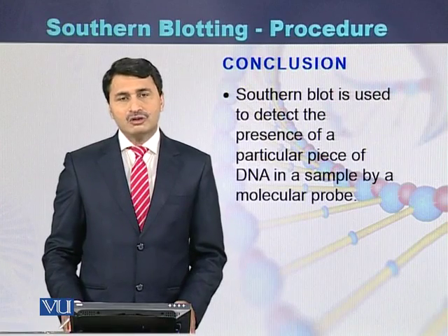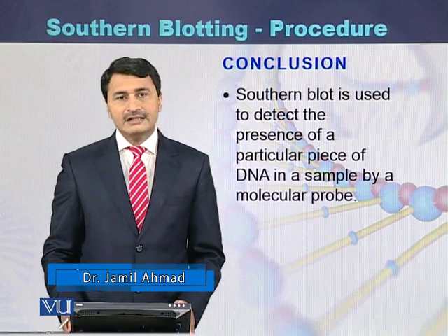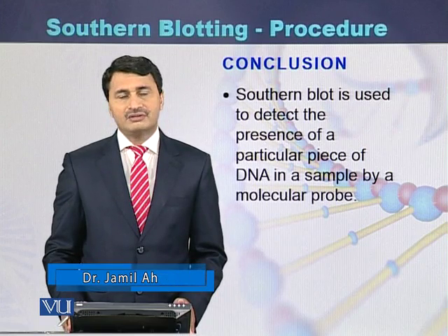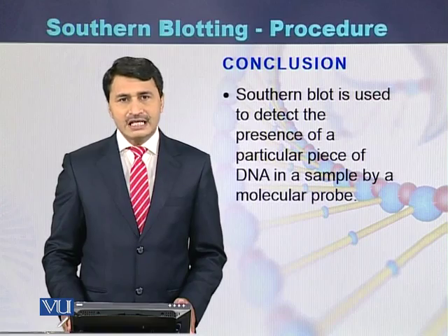So if we conclude, the procedure of the Southern blot is a technique which is used to identify a particular sequence of the DNA or a particular mutation from the DNA sequence.